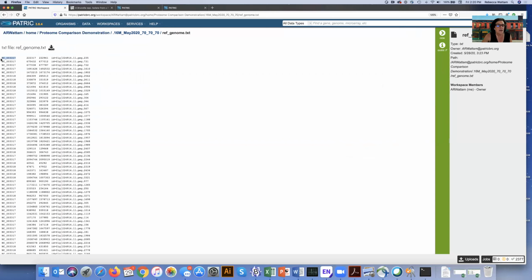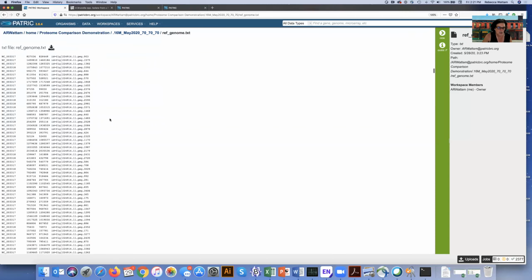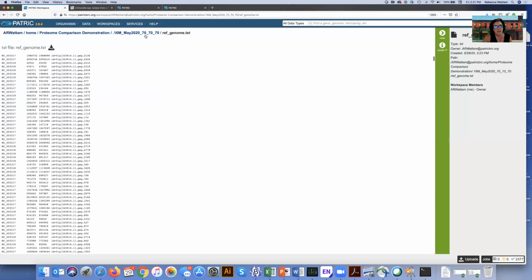This tells me that this is the accession number for the contig, and this gene started on that contig at that location, it ended at that location, and this is the particular gene. So there are like 3,000 some genes. It should have one for each of those here. Let me click and go back here.